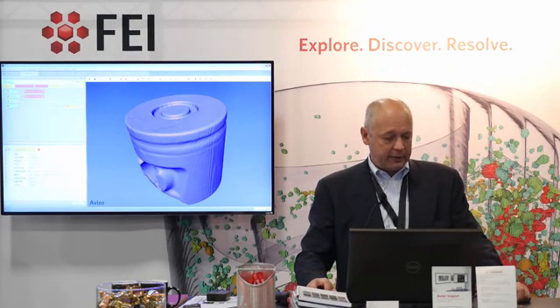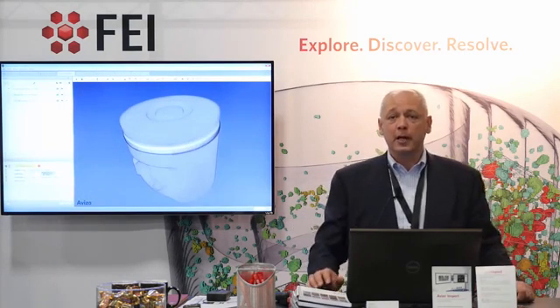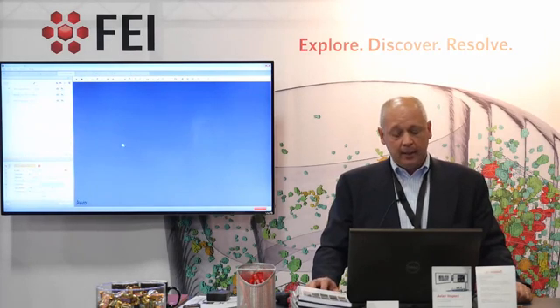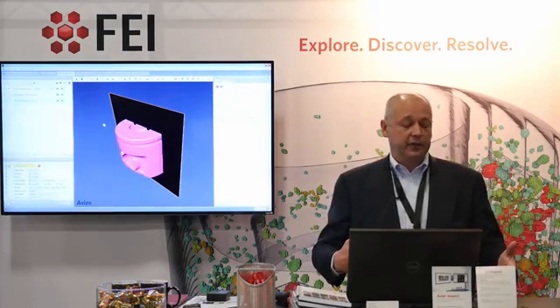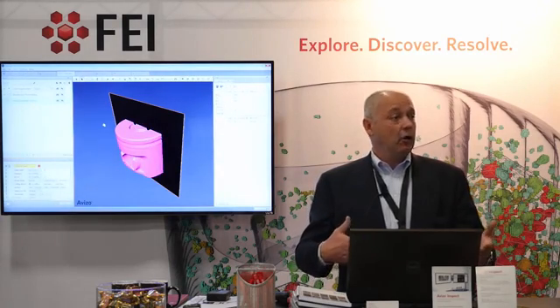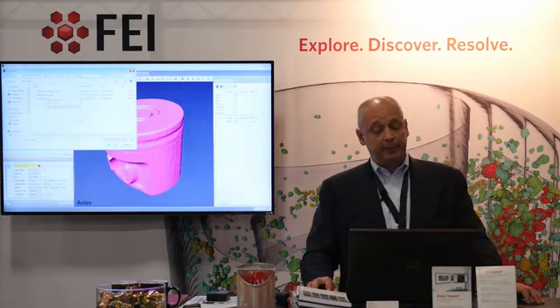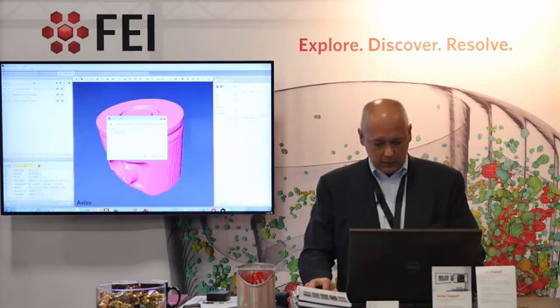And I can actually click on my result there and go to create recipe. I'm going to switch to my recipe workroom, and automatically I can replay this recipe. I can set breakpoints if you want to modify some of the parameters of the workflow, and I can run my recipe, and automatically it's going to reconstruct my 3D surface. I don't have to redo all of the steps again. So you can imagine a very complex workflow like this, with possible interactivity inside or totally automated. You can save your recipe, and then you can load different types of recipes that you have created using this Avizo Inspect.